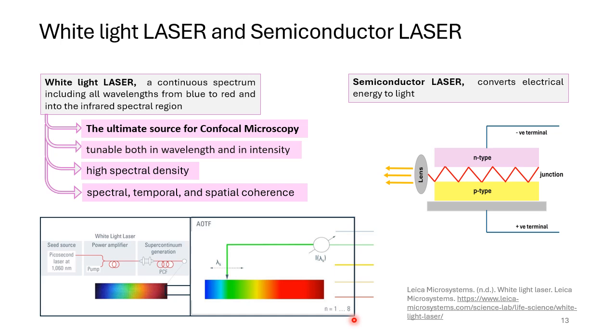So this is very useful, and generally it is not the only, but one of the most used light sources for the confocal microscope, and I'll discuss that confocal fluorescence microscope in my later slides.